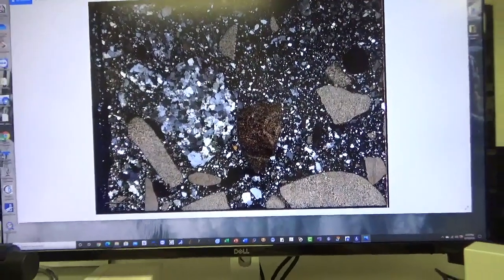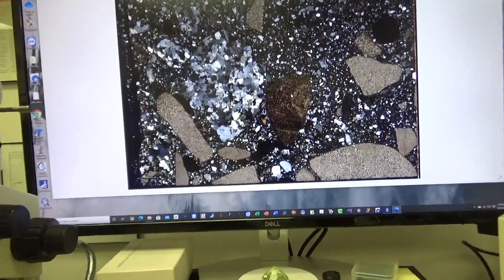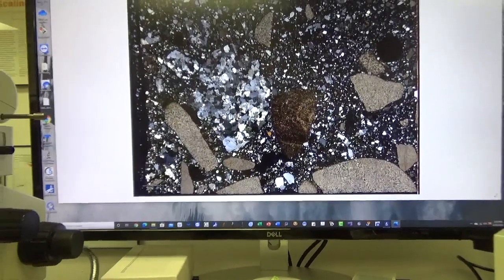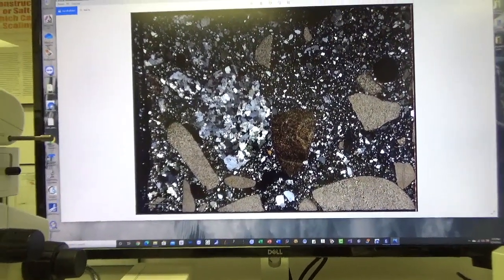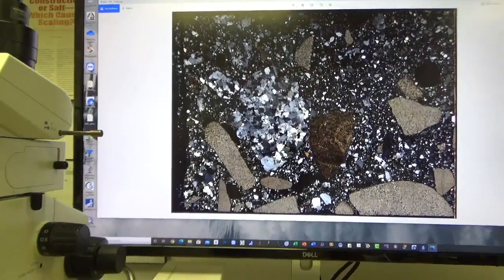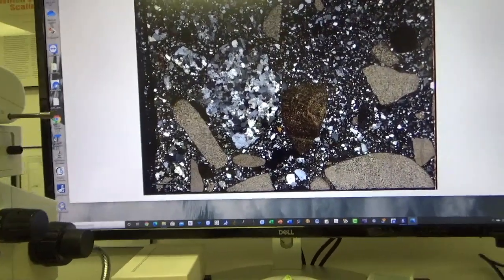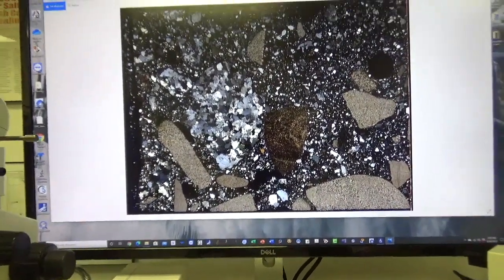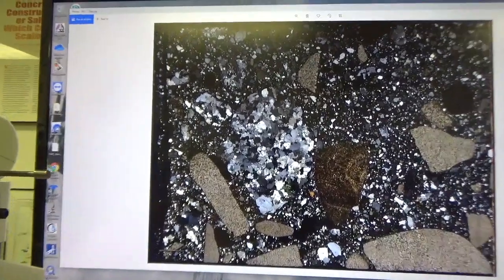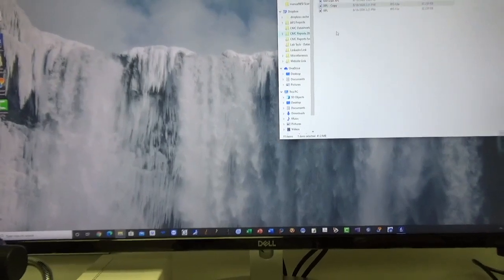So you can see now the distribution of crushed limestone, the shell particle, the argillaceous limestone, the crushed granite, the siliceous calcareous sand fine aggregate, the coating, the urethane coating with the quartz filler. A lot of information can be obtained from this whole slide scanned image. So that's how a lot of processing can be done with the whole slide once you scan it.